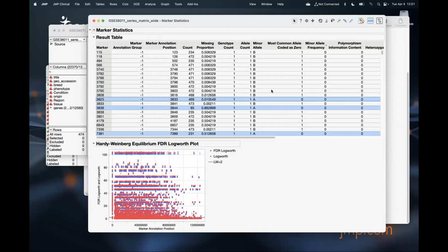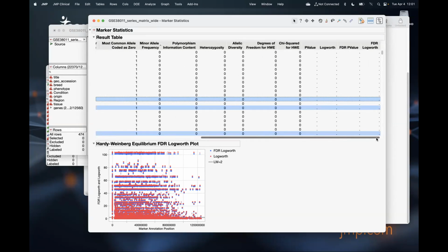Now, those are by frequency in the population that we're looking at, which is really a subsample of the true population. The most frequent allele will now be coded as 0, and the least frequent allele, being B here, would be coded as 2. So now we have that as well.